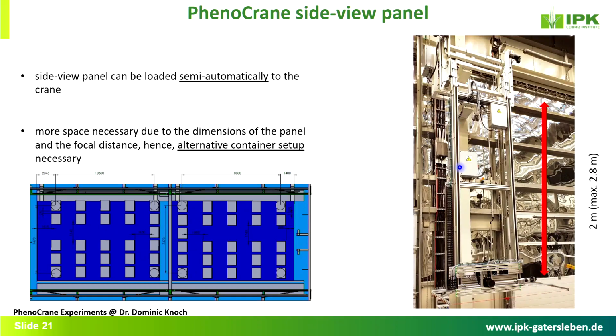And last but not least, we have the side view panel as well, which looks like that. It can be semi-automatically mounted to the crane. And then we can also capture side view images of plants of up to 2.8 meters in size.